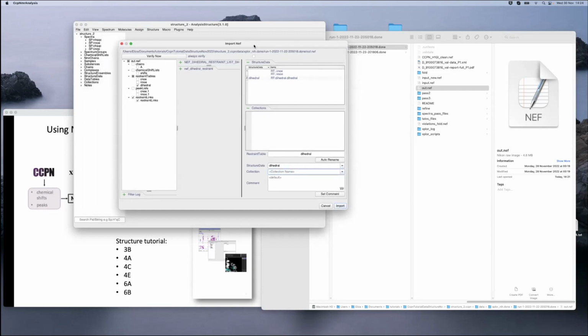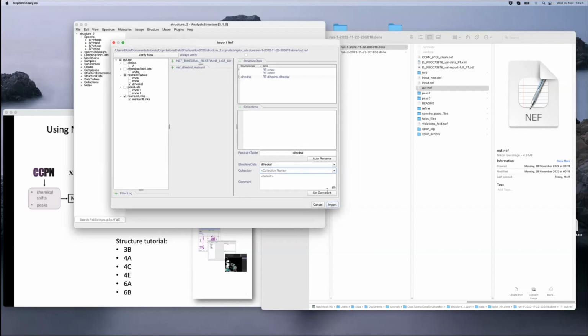You can think of it as essentially a bag to which you can put whatever you want for whatever reason. In structure calculation, that becomes very useful because we can collect everything that, for instance, comes from run number one into this bag. So we can organize it, but we can also use that collection for driving certain analysis. I'll just prepare myself a collection, run one, and as I press Enter, that's automatically added to this collection.